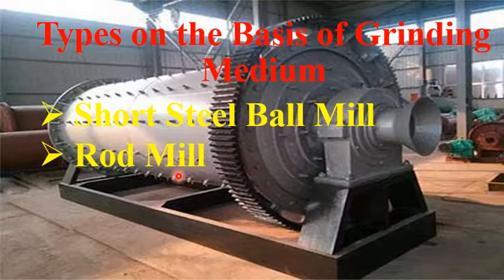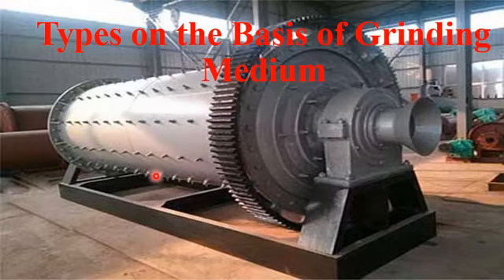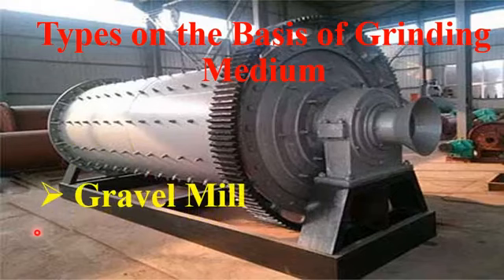Okay, another type of the ball mill apparatus based on grinding medium is known as gravel mills. Okay, so this is the third type of the ball milling apparatus. So dear student, it is clear from the word gravel mill that the gravel mill uses gravels.